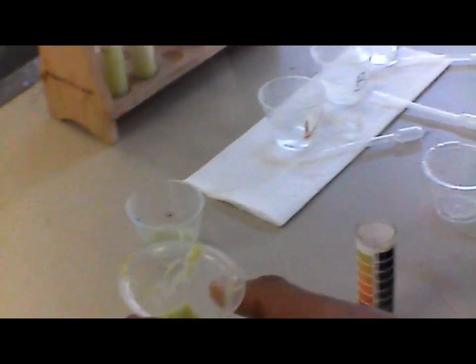Alrighty. Next, we got to do the baking soda. So we got to put 30 drops of avocado in another cup. We got to clean the beaker. How do you clean that out? Alright, now we take, get this. 30 drops. Do we do the 5 cc's for the... Yeah, just do the same.